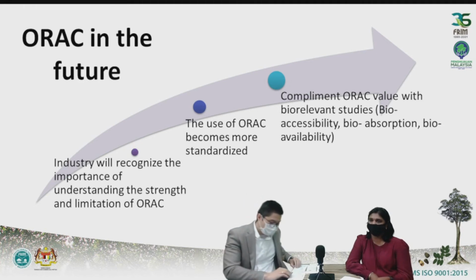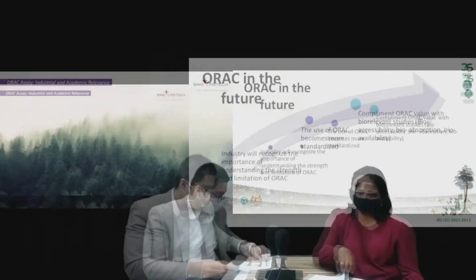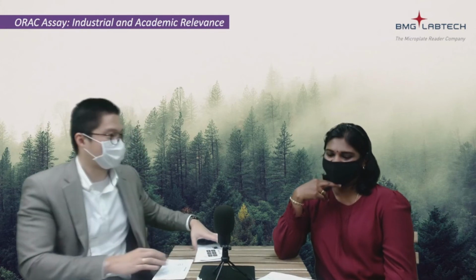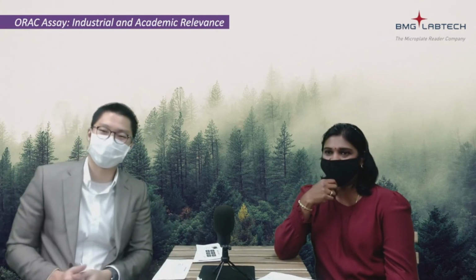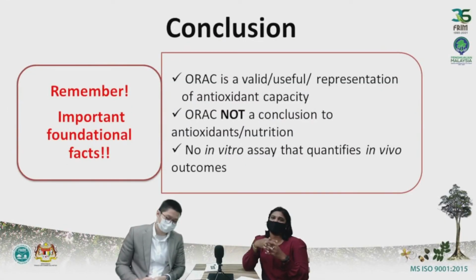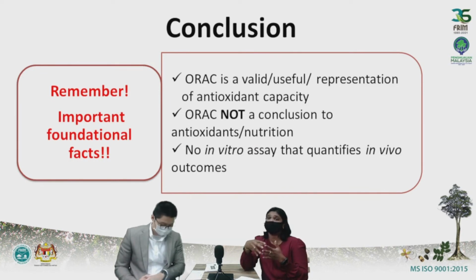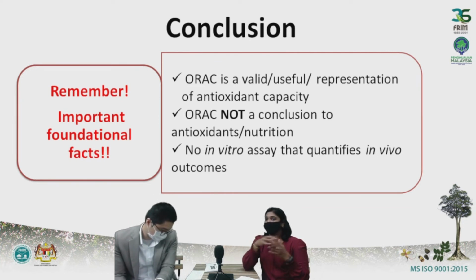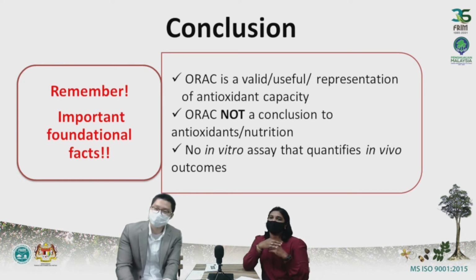Okay, so my last question will be in terms of your concluding thoughts. In your conclusion, any important message that you want to convey to the audience this morning? Yes, definitely. As the conclusion here, I wish to stress the important foundational facts, where the ORAC is definitely a valid and useful representation of antioxidant capacity, and the ORAC is not the conclusion for the whole antioxidant story or the whole nutritional story, and no in vitro assays can quantify the in vivo outcome.